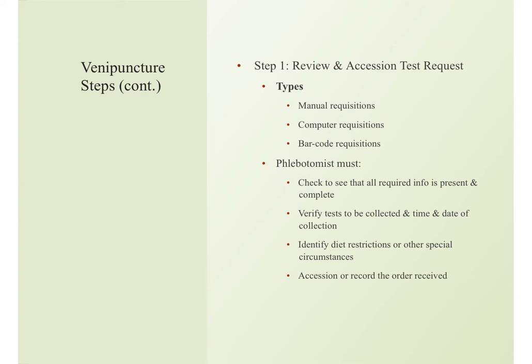So accession, again, is what happens when we enter something in the computer, it gives it an accession number. So that's a number that's going to track that test all the way through to the test results, okay? So if the doctor's looking up something or looking for the results, we can go enter that accession number and find out what's going on with the specimen, okay?